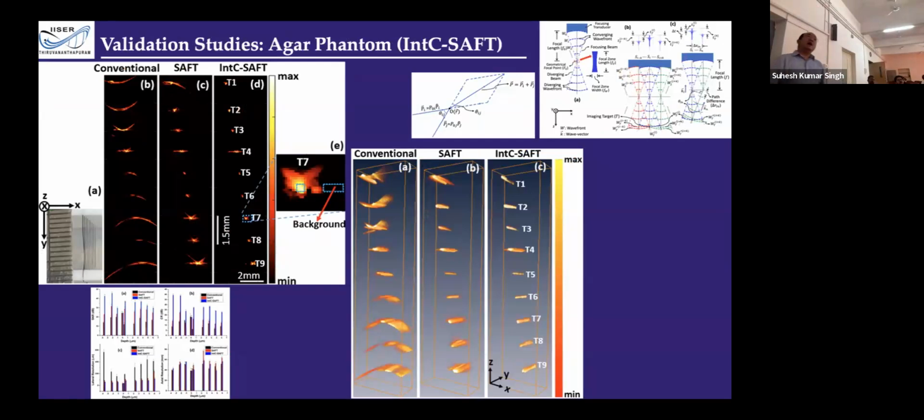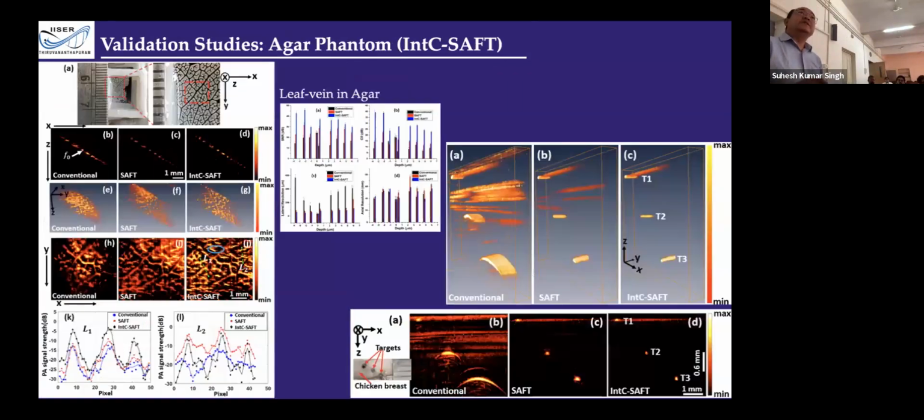Another one that I was talking about is the correction from the interference point of view. If we look back, it is well reconstructed over here. I missed marking it, but it is of the order of 1 centimeter, from 1 to 12. So the penetration depth is of the order of a centimeter, maintaining the lateral resolution at 30 to 40 micrometers. Okay, so this is our contribution.